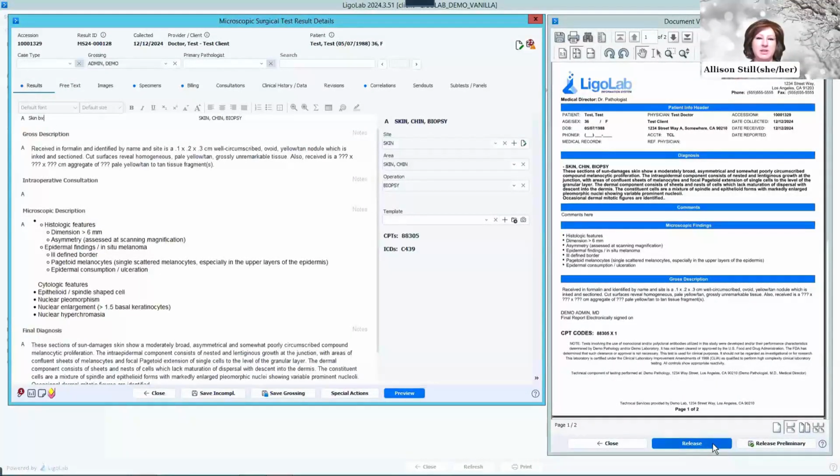The queue can be configured to just open the cases sequentially, right? So just silently open the next case. If you don't want to scan the slides every time, that can be a nice way to work this queue.